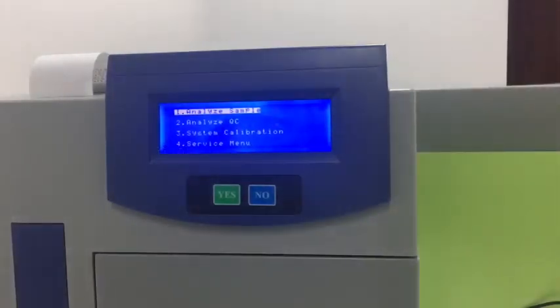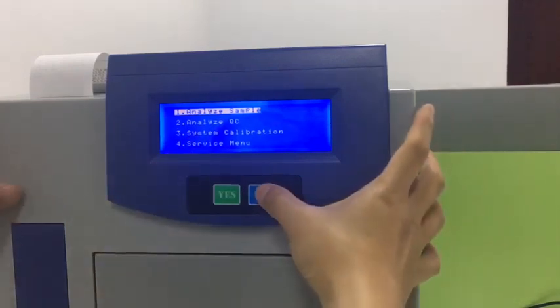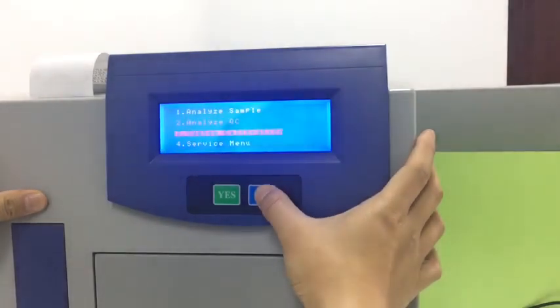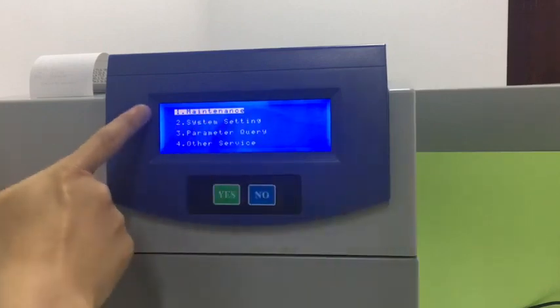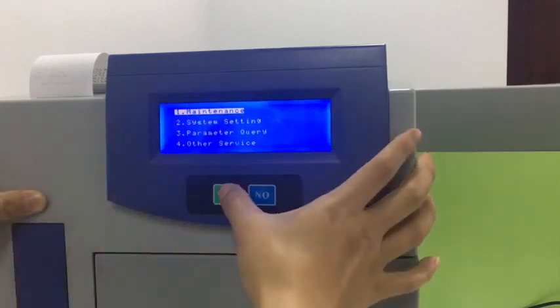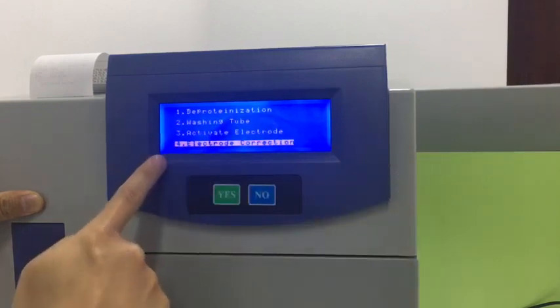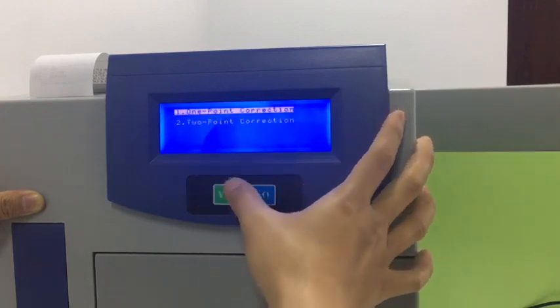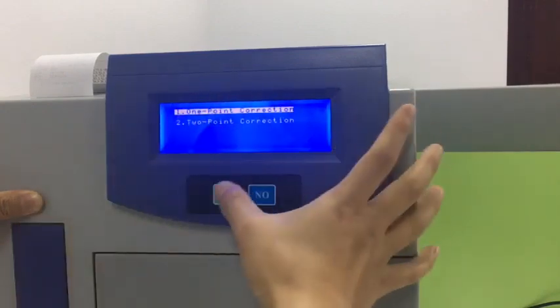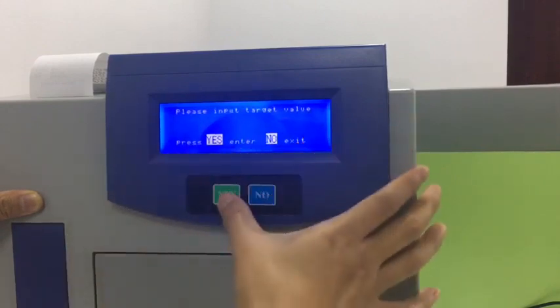After calibration, the machine will show this menu and we press 'No' to change the options. Go to the service menu, then go to 'Maintenance', press 'Yes', and go to the last option, 'Electrode Correction', press 'Yes'. Then select 'One-Point Correction' and press 'Yes' because we need to set the target.